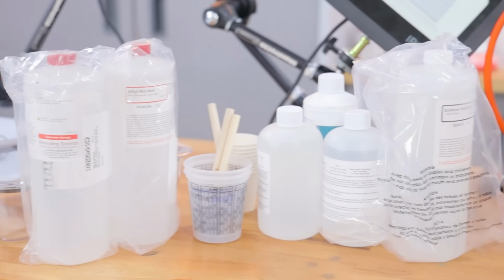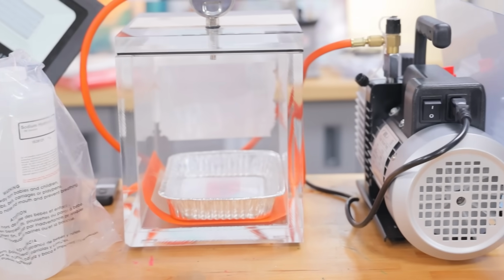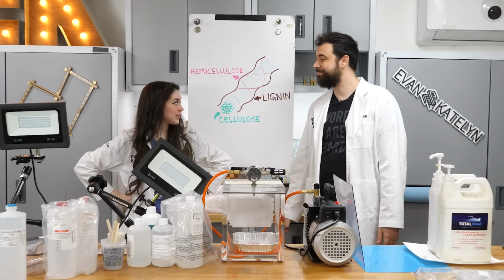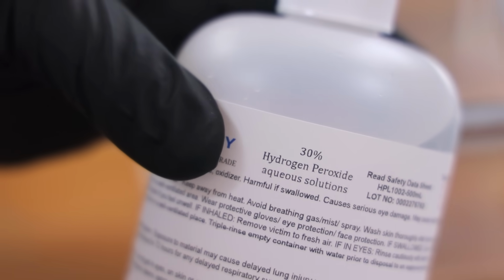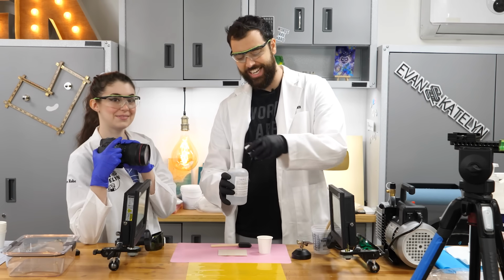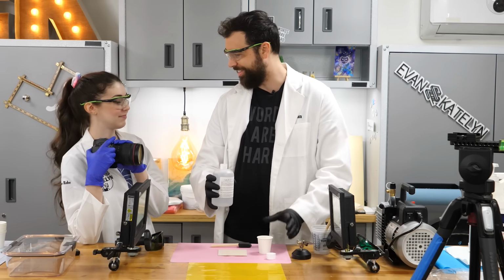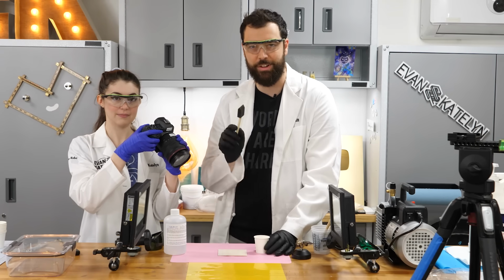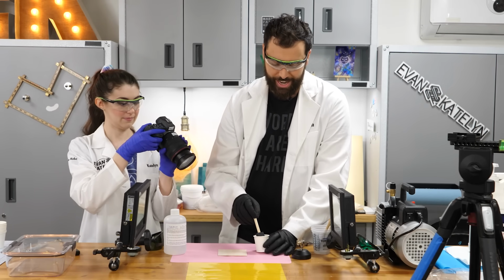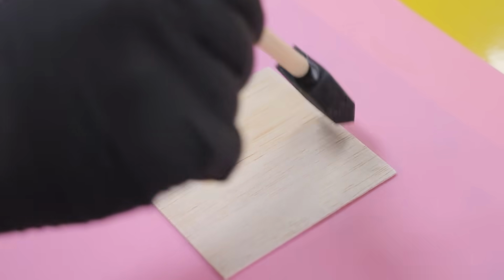So we got a bunch of lab grade chemicals and fancy vacuum equipment, and we'll just start with step one. Let's bleach some wood. All right, so we are using 30% hydrogen peroxide, which isn't the stuff that is safe for skin contact. It's certainly not the stuff that you treat your skin wounds with. No, please don't put this on wounds. When you're dealing with more intense chemicals, you definitely want to read the material safety data sheet and know what you're doing to a certain degree. So we're just going to be brushing this on.